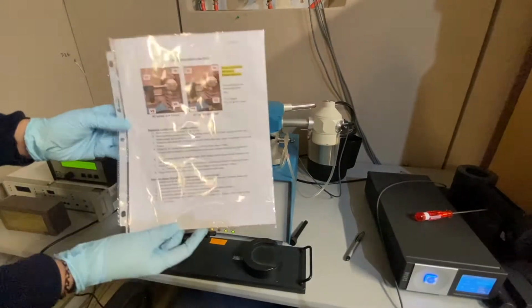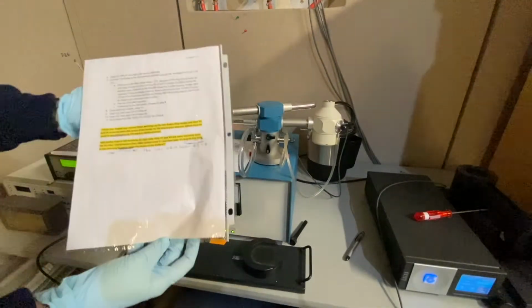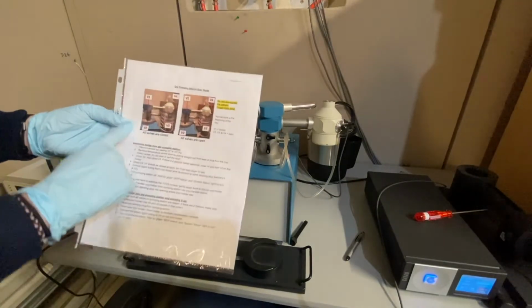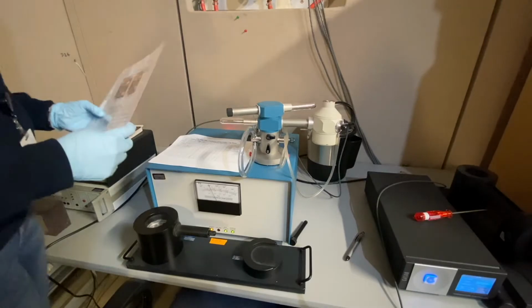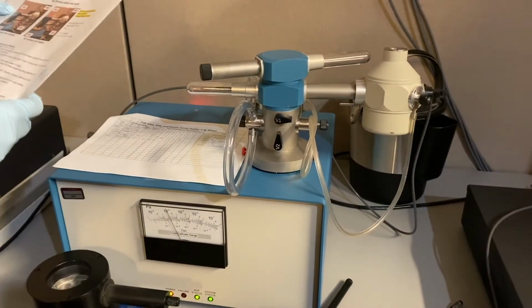The removal of the 626 holder. This is our pumping station. Today we will work with the 626. Located at our station is a step-by-step manual on inserting and removing the 626. Following along with the manual's diagram, we can see where all the valves are located.